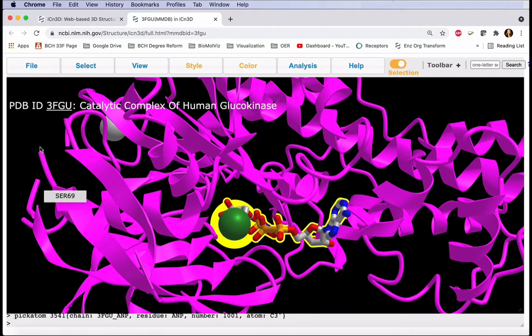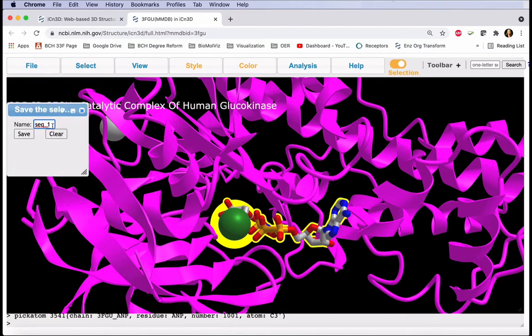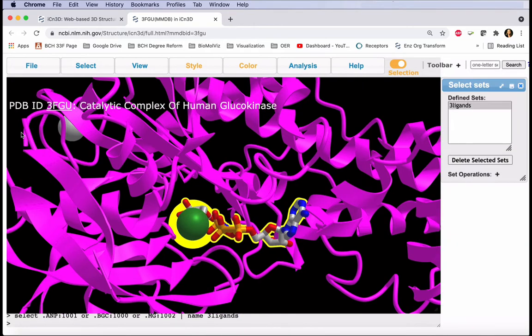To save this selection, select Save Selection, and type a name. I'll call this Three Ligands. The Select Sets menu comes up, and here's our defined set.